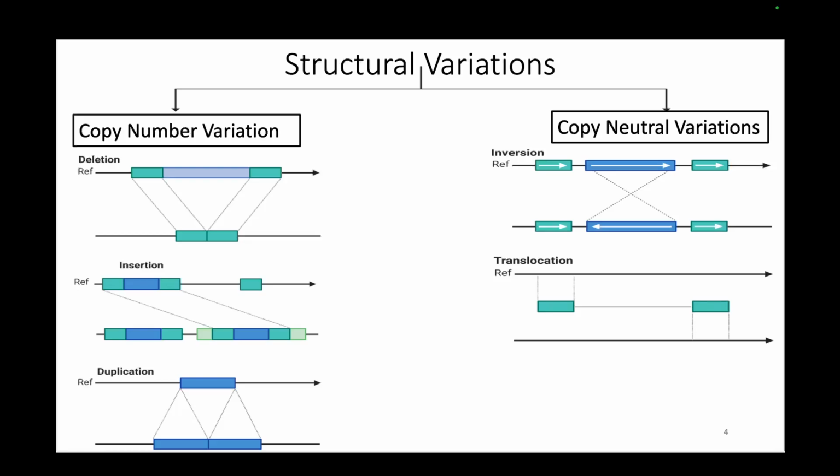So more reads have been generated from that particular region compared to the other parts of the genome. We will see the coverage suddenly increasing in this part compared to its flanks and other parts of the genome. If there is a dramatic increase in the number of reads aligning to that part of the genome, you can intuitively think of it as a duplication.